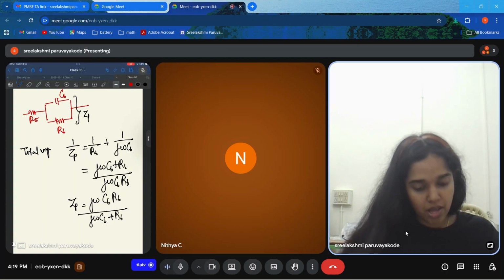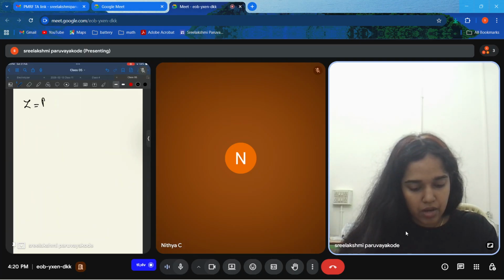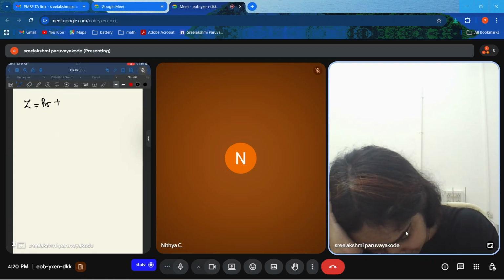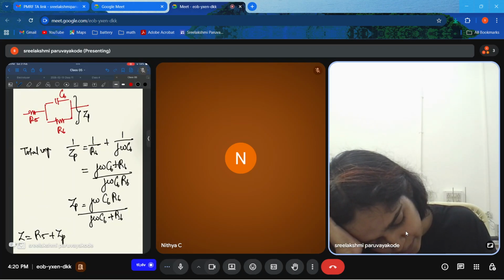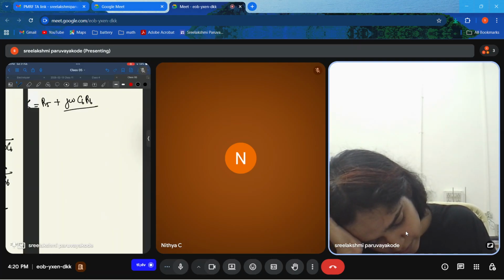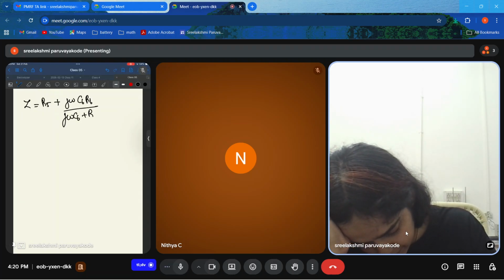Now this is in series with R5. So the total impedance is R5 plus Zp, which is R5 plus j omega C6 R6 by j omega C6 plus R6.